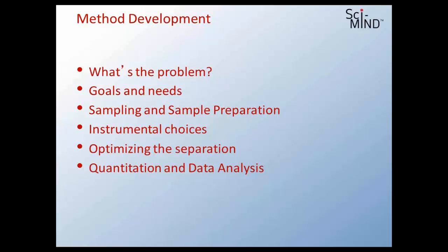or that will be a great opportunity to start off our question sessions. But let's think a little bit about method development now, and I think one of the challenges that we start off with is even thinking about what is the problem, what are we trying to solve. What are the goals of our analysis? What do we need to get done? Are we going to be running this method 100 times, 1,000 times, or maybe it's just a one-off? I think that really impacts our development process and the kinds of resources and the types of instrumentation that we're going to use.